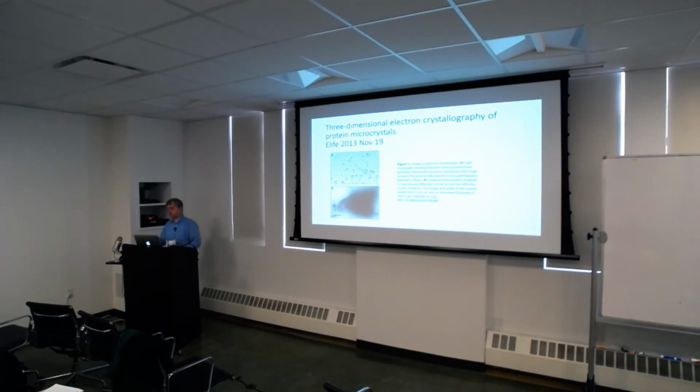And do the crystals degrade at the same rate? The electron beam is less harmful than the X-ray beam. I think that's why you need a bigger crystal. It's my understanding that with a bigger crystal you have a lot more to damage.